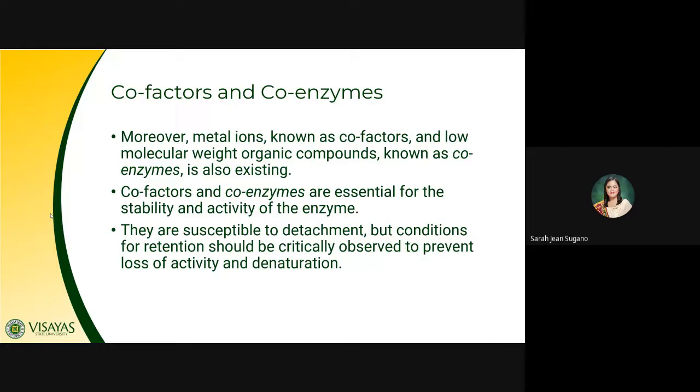It should be maintained at a particular pH. So enzymes, like other proteins, are prone to denaturation. Just like with your Taq polymerase, and also if you are using endonuclease for your molecular experiments, you have to observe proper usage of these enzymes. When we are talking about molecular experiments, we use these enzymes for the degradation of certain strands of DNA, like single-stranded DNA. So if you do cloning, or restriction digestion, you have to use enzymes, and enzymes are very, very pricey.